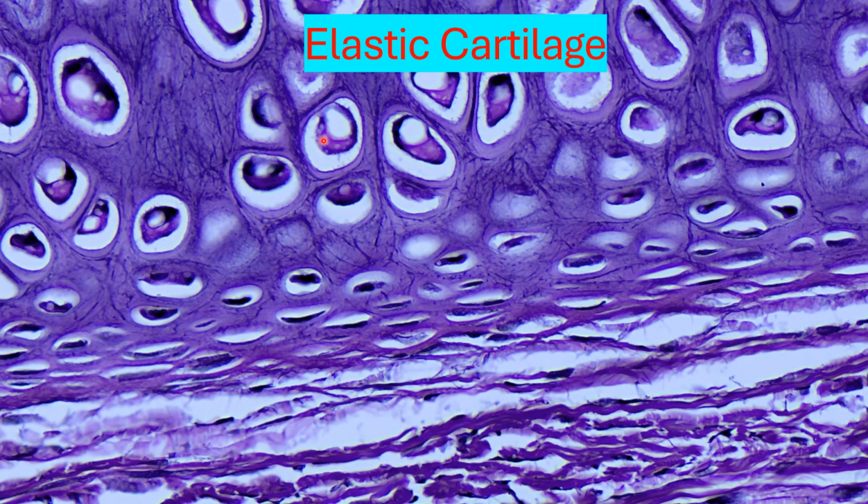Now we've seen hyaline cartilage, which just has this glassy-like appearance, but elastic cartilage has these elastic fibers staining darker purple in this case, that are interwoven between all of these different lacuna existing within the extracellular matrix. Another way to differentiate it is elastic cartilage has an increased number of lacuna and chondrocytes compared to hyaline cartilage, but this is elastic cartilage.